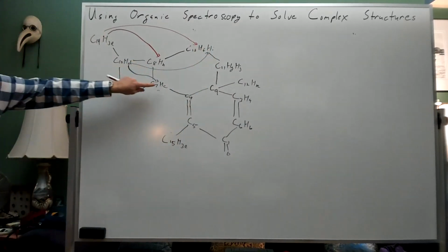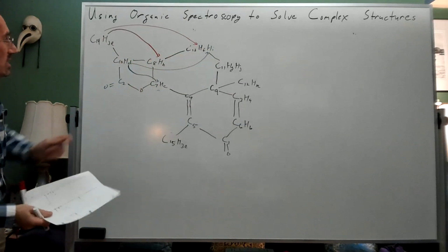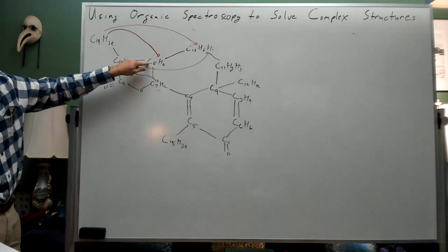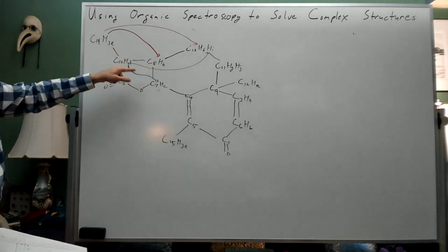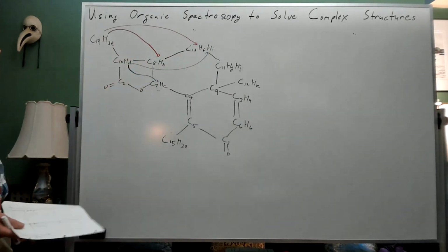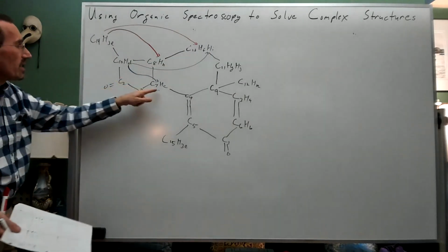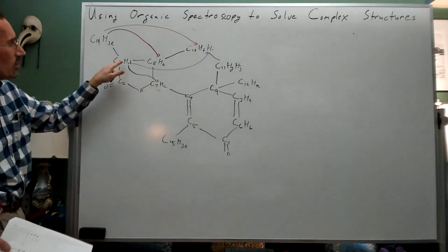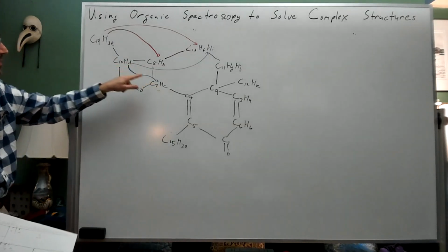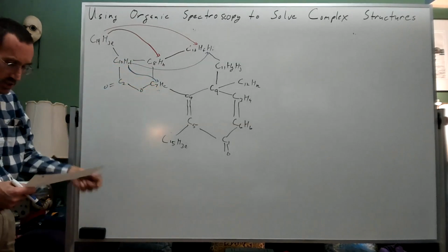And I like these non-adjacent NOEs because adjacent NOEs aren't very interesting. Adjacent NOEs generally, even if two protons are trans to each other, you may well get an NOE. But particularly on a 5-membered ring, this type of NOE across the ring really is pretty good indication these protons are cis to each other.